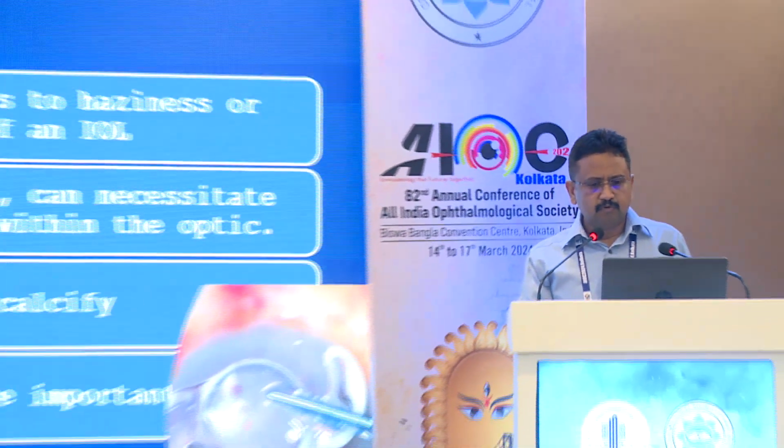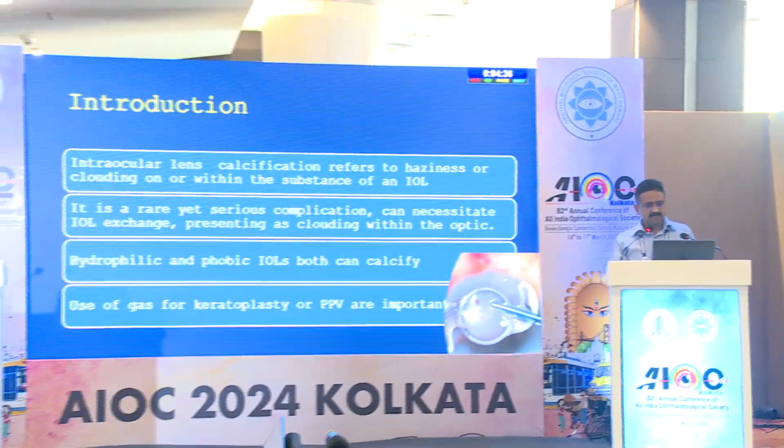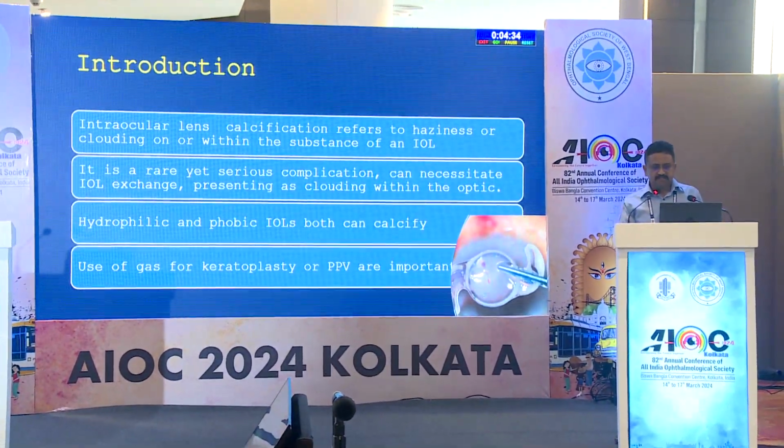I'll be presenting on optical density and polarized light microscopy to confirm calcification of intraocular lens. No financial disclosures. Intraocular lens calcification actually refers to haziness or clouding within the substance of an IOL. It is a rare but serious complication, and most of us would have encountered this in our lifetime. It can lead to IOL exchange.